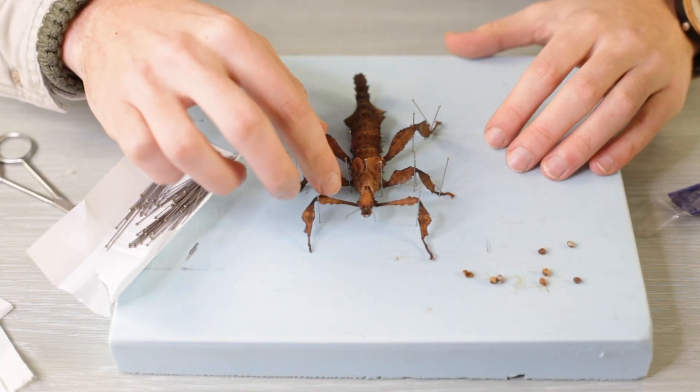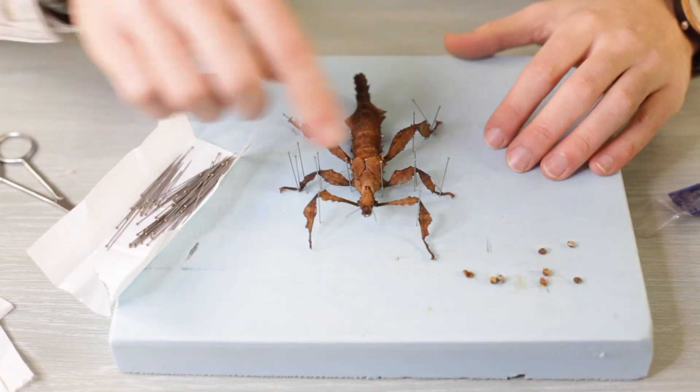So do you have stick insects or any kind of insect and you would like to pin them, like to preserve them or display them? Then watch this video and I'll show you step by step how to do this.